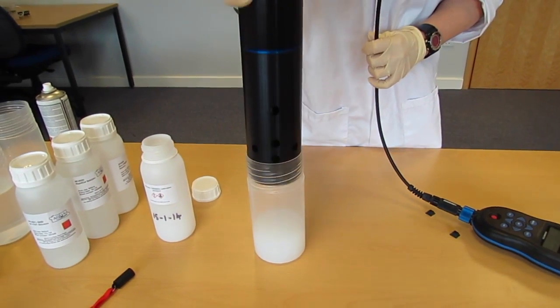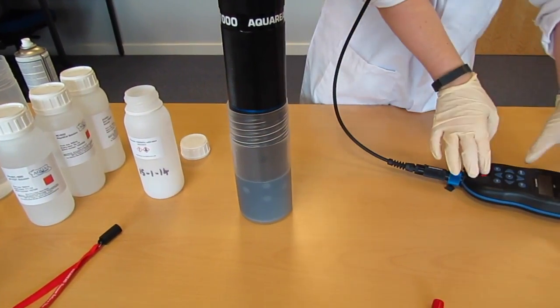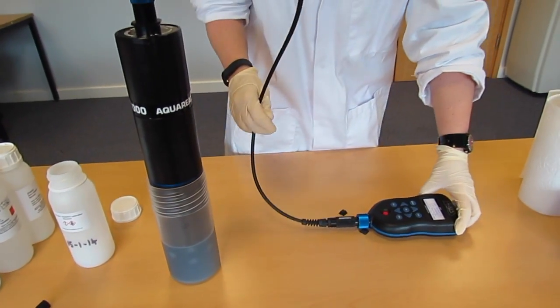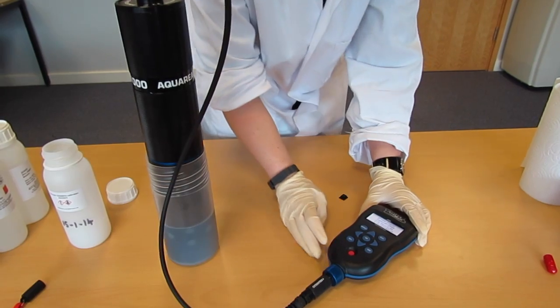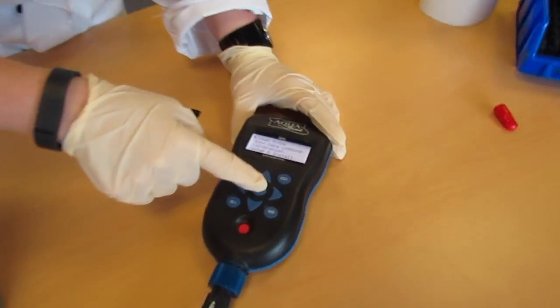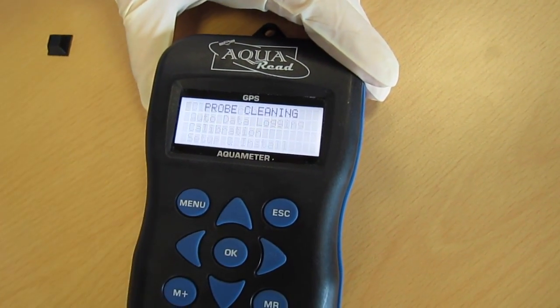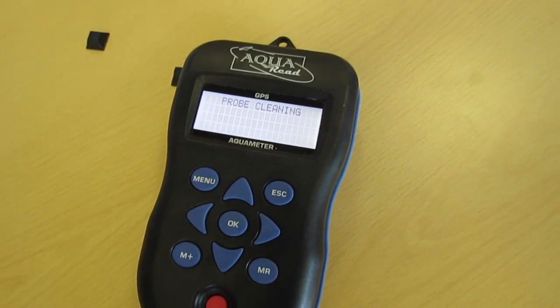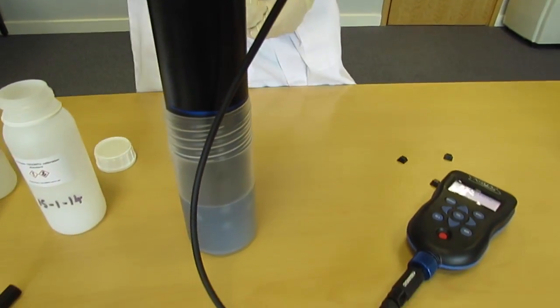Insert the probe into the solution. Turn the meter on and go to the clean probe setting on your meter. Press OK and allow the probe to clean to dislodge any air bubbles on the TURB electrode before calibrating.